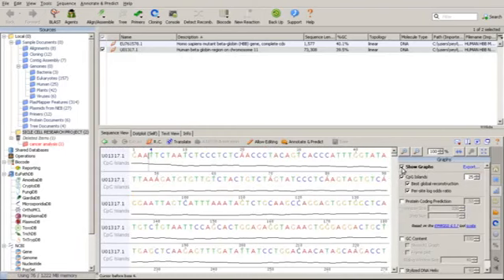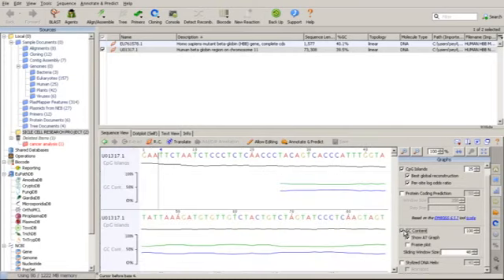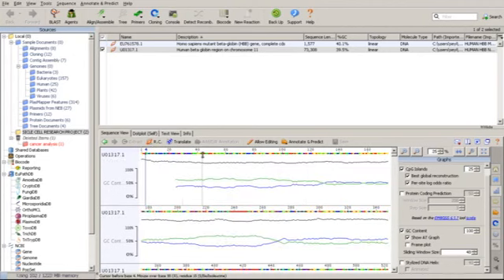To talk about the graph the other time, you can choose to remove it and then put it back. Then GC content. Now this is a graph for GC content, and that's significant to this graph. As you can see, we have green lines and we have blue lines. I told you the other time concerning GC content and AT content. If we're talking about GC content, we're talking about blue lines, and if we're talking about AT content, we're talking about green lines.